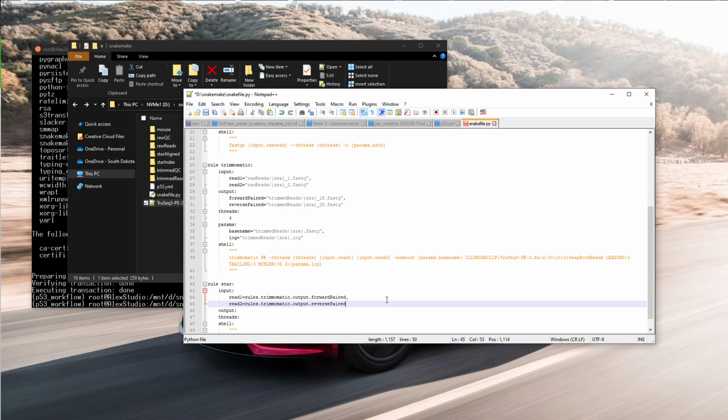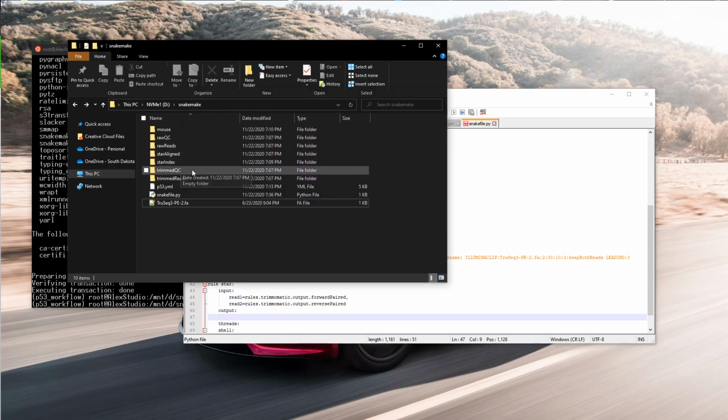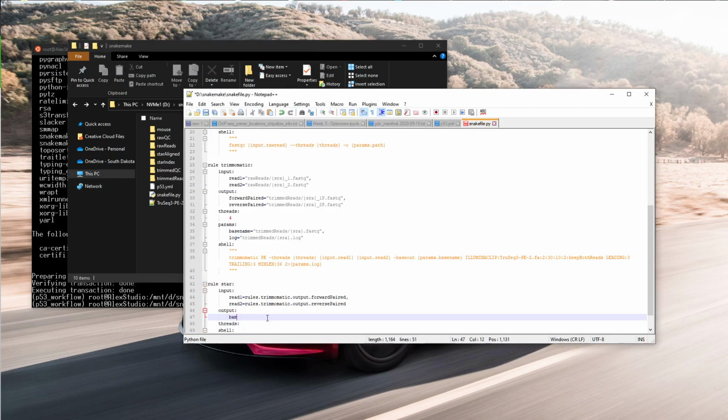All right. Now the output from STAR, in this case, as the shorter video goes, we're just going to look at 2 different things. We're going to look at the BAM and the logs, but you can go through, like when we ran STAR before, we had the mate 1 and the mate 2, which were unmapped reads. We had actually 2 different log files, but we're only going to look at one of them. You have the BAM, a lot of stuff. But we'll just look at the BAM and a log file. We won't look at both of them.